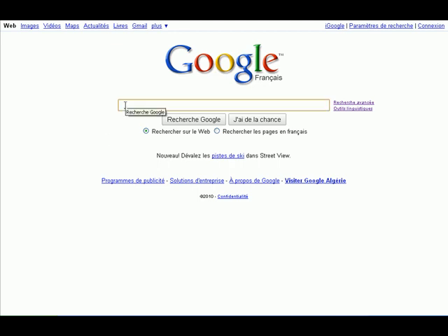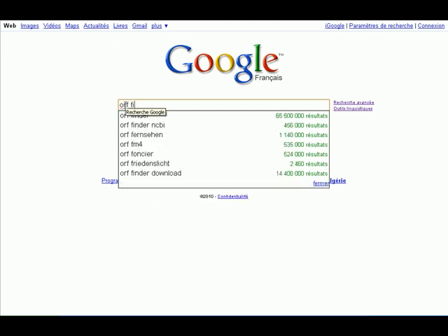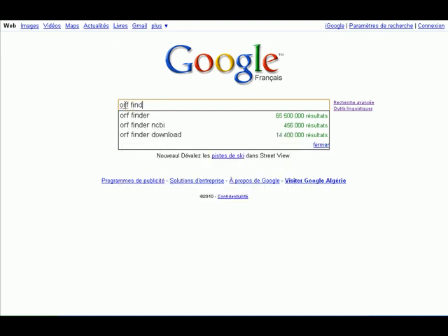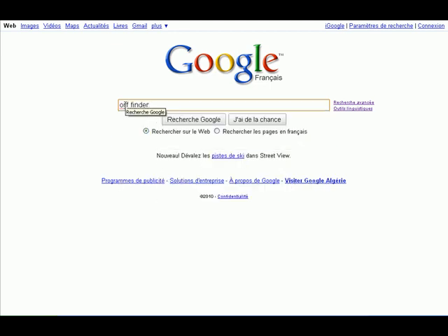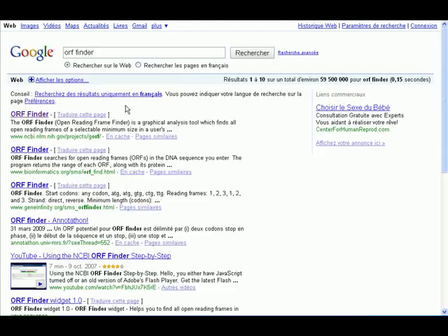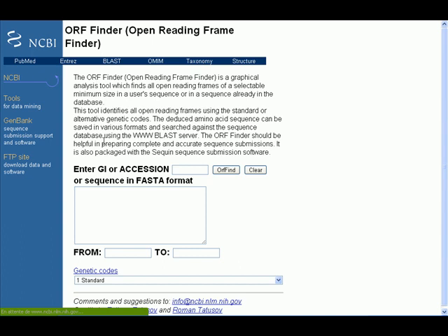We go to Google and write ORF Finder and hit enter. The ORF Finder is software located on the NCBI website. We click on the first hit. This is our software.